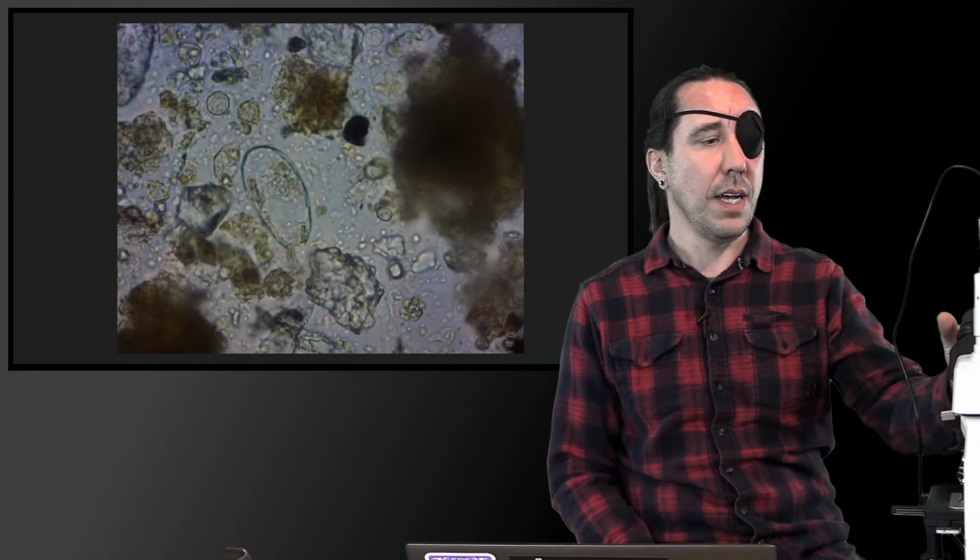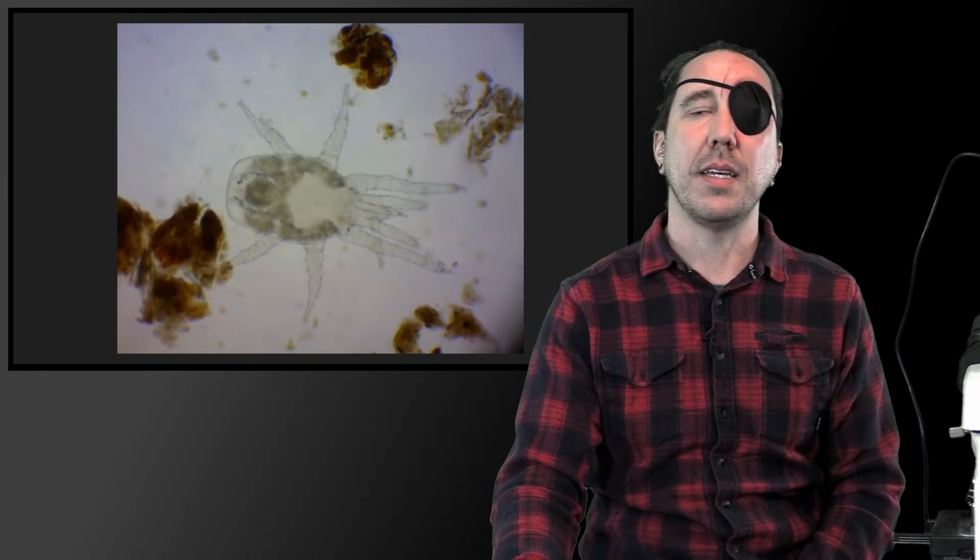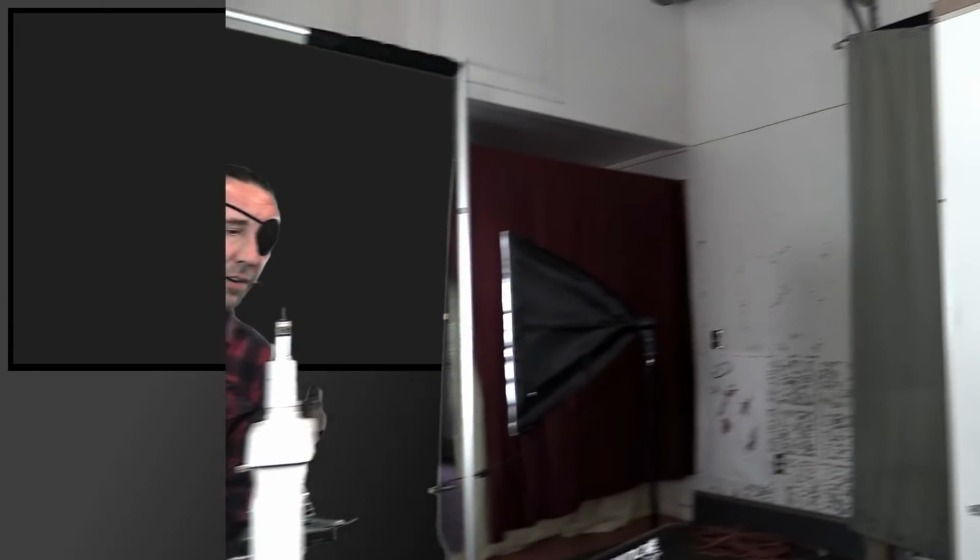And then as far as the microscope, we're using 10x eyepiece lenses, and for objective lenses, we're generally only using the 4x or 40x. Sometimes I'll use a 10x when I'm looking for nematodes. But now we can get into how I go through a slide. It might be easy to use the paper again. I think it might be good to use that just to show quickly how I go through the slide.